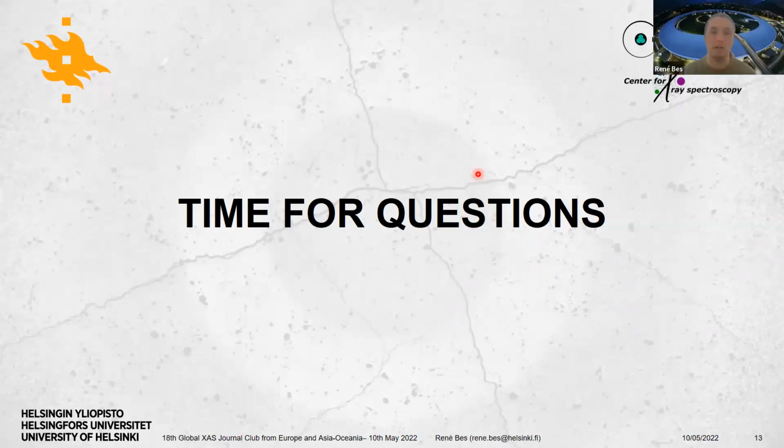Yeah, thanks. And usually for the calculations, especially FDMNES, because it's DFT based, normally nobody should use DFT in order to understand X-ray absorption, because DFT is essentially ground state calculation, right? And we are not in the ground state anymore when you perform X-ray absorption. But luckily, it works quite well most of the time.